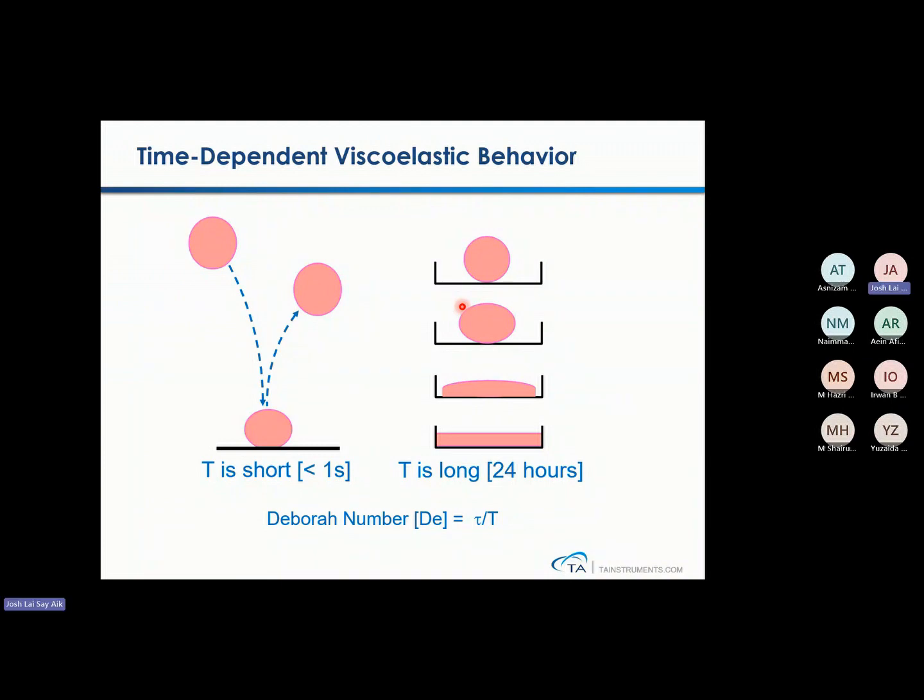You need to understand this no matter how. Viscoelastic behavior is very time-dependent, meaning that it always correlates to the speed of deformation. You give an impact speed, or you just let the impact go slowly.